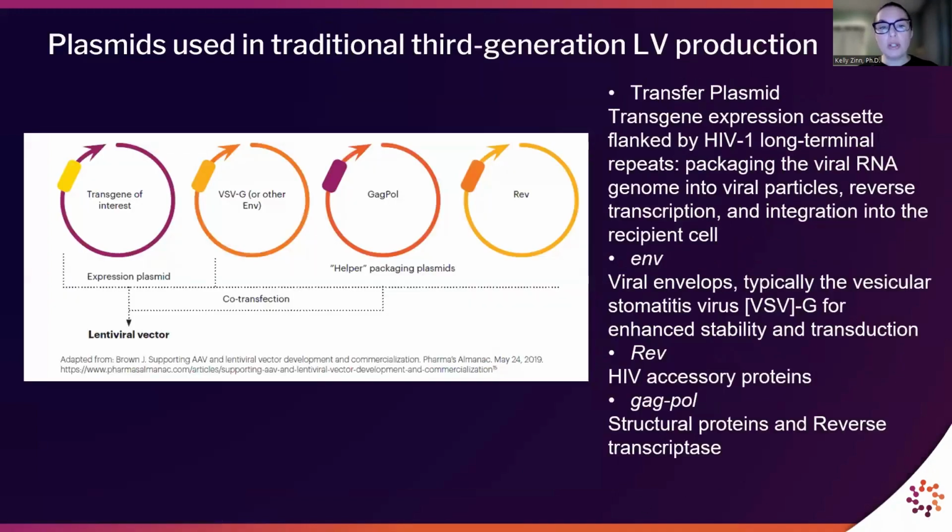I won't go much into the biology of lentiviruses, but I will briefly talk about the genetic elements used to generate replication incompetent lentiviral vector. So the third generation lentiviral vector is based on transient transfection in HEK293, that's human embryonic kidney cell lines, and physical separation of the vector elements across 4 separate plasmids, and removal of key HIV elements contribute to preventing generation of replication competent lentiviral vector.